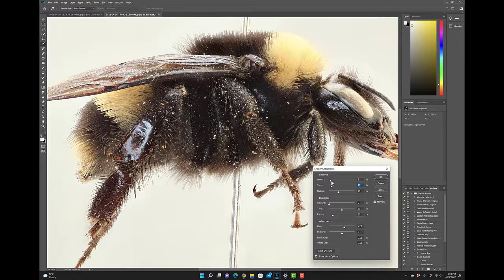If you drop the tone, then when you do manipulate shadows, it's not such a significant change. It's not one that washes it out. It's not one that's destructive. So you can see how much more subtle it is now. This is the standard. This was as it was taken. This is introduced at 5% to get rid of the shadows. So we brightened areas that are much darker.